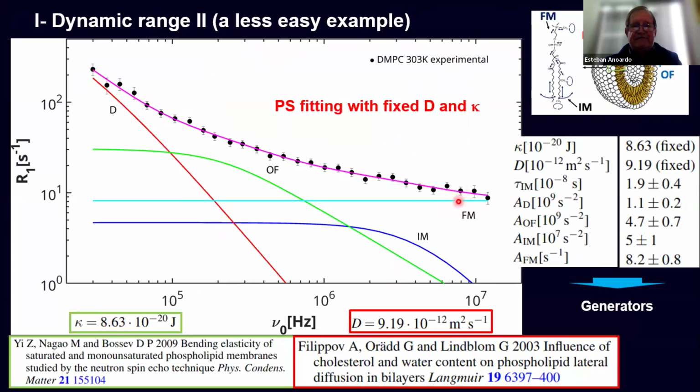And we see the different processes that are involved in our model. Diffusion, or the fluctuation of the lipids. Now we replace it here, it's not rotation. Now we interpret that, in general we call it intramolecular motion, and the fast motions that are also intramolecular.